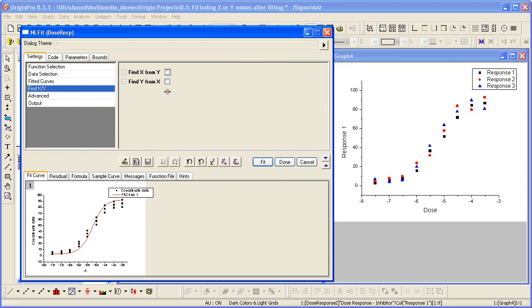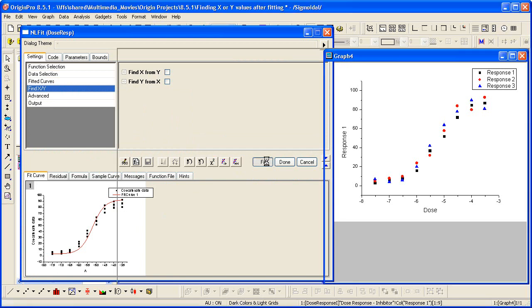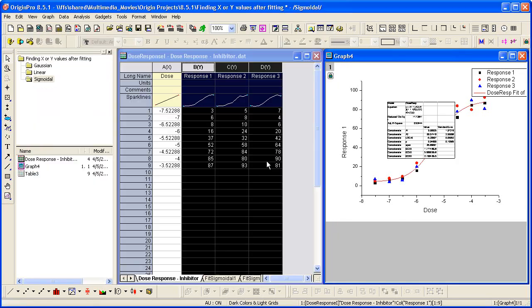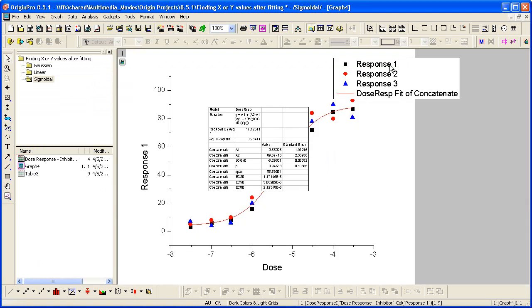Turn on the feature here. Actually, I'm not going to turn it on for now. Just to show you, you can enable that at any point. So let's go ahead and hit Fit. We get our fit. Let's take a look at the graph here. Expand our parameter table.